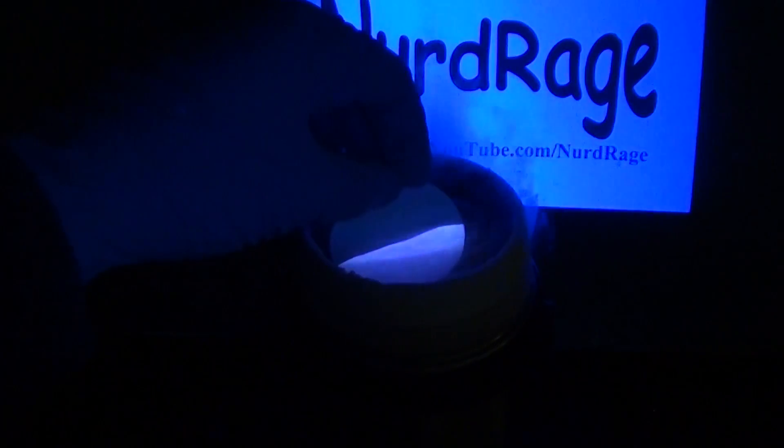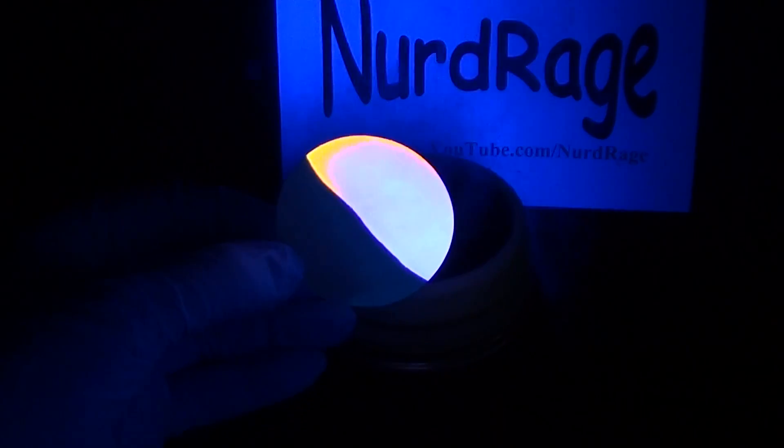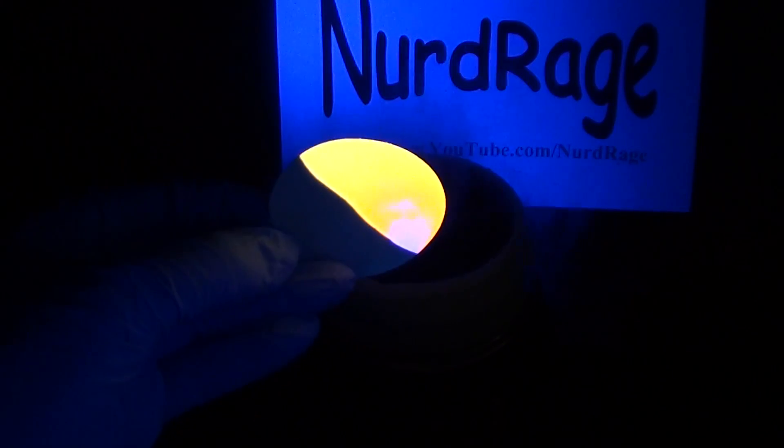Greetings fellow nerds. In this video we're going to demonstrate temperature sensitive fluorescence, also known as fluorescence thermochromism.